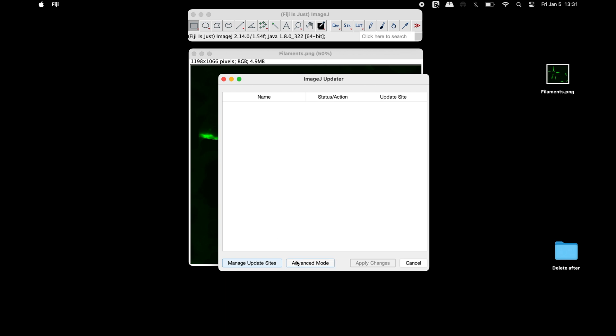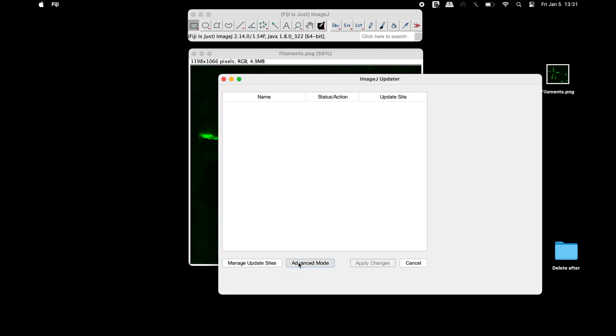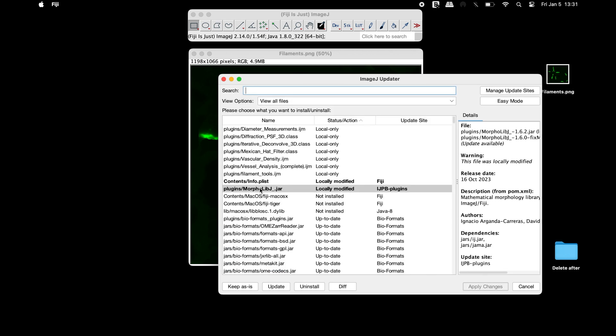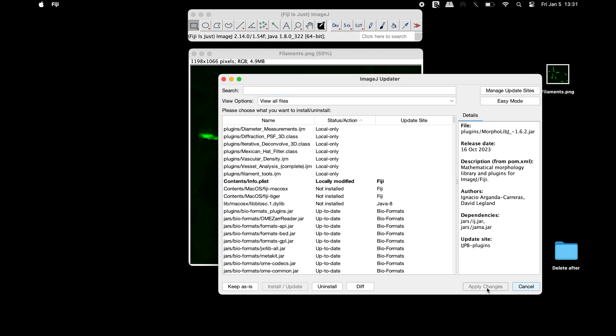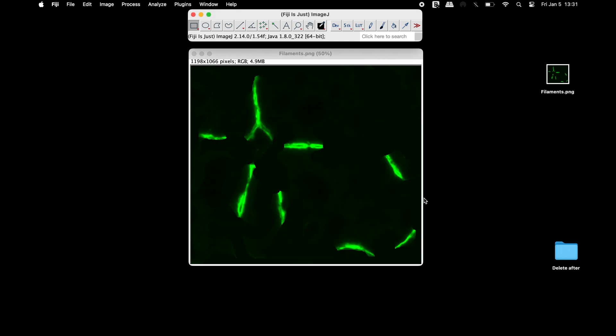To update the plugin, click on advanced mode and select the plugin to install the update. A restart of Fiji may be needed to complete the installation.